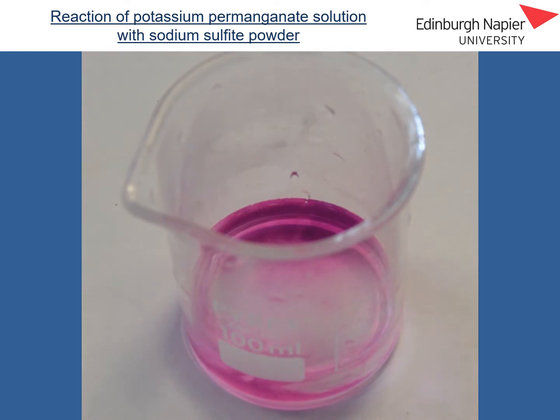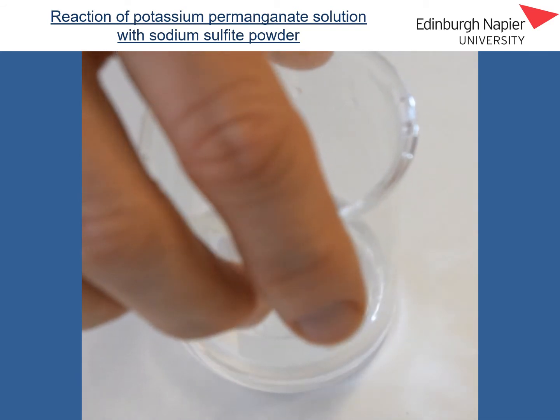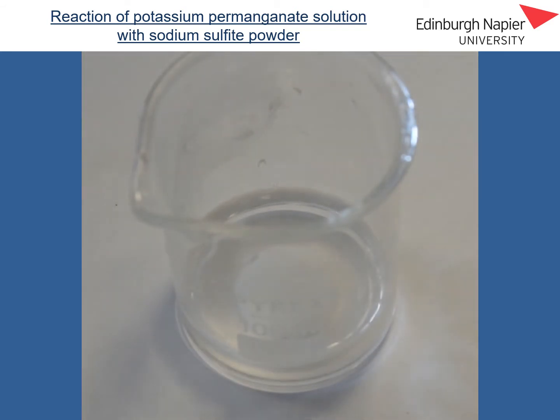If I give that beaker a little swirl, you can see quite clearly that we have lost the purple colour of the permanganate ions, as those permanganate ions have been reduced to manganese two positive ions, and the sulphite ions from the sodium sulphite, they have been oxidised to form sulphate ions.